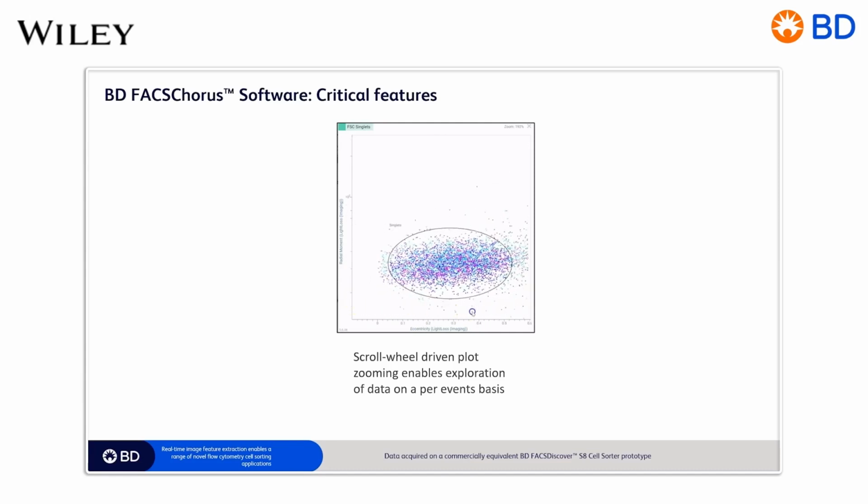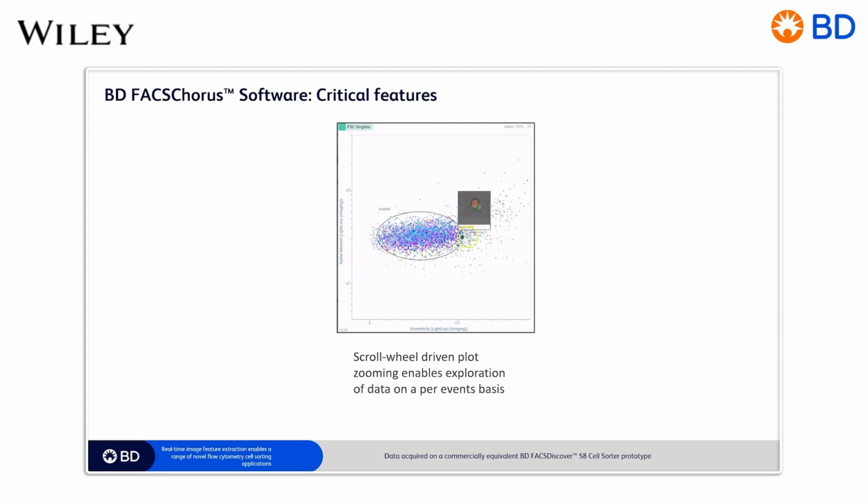What you can do is hold the mouse over the x-axis or the y-axis and use your scroll wheel, and you can expand or contract that scale. And then you can also zoom in to a plot and actually look at each of the dots at a very granular level. So it really allows you to mouse over really dense populations, and then zoom back out and get the plot to where you had it before. So that's also another nice feature.